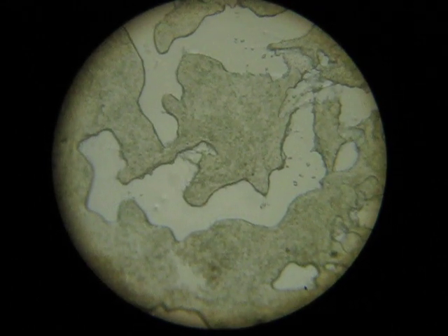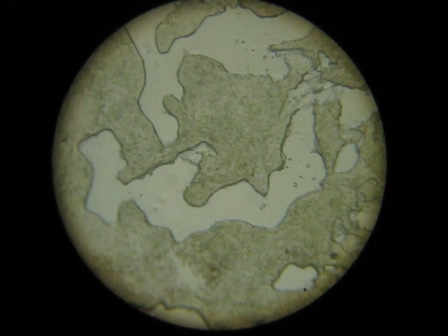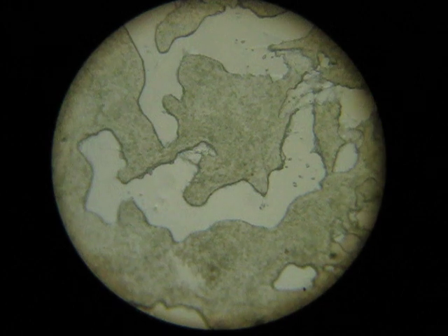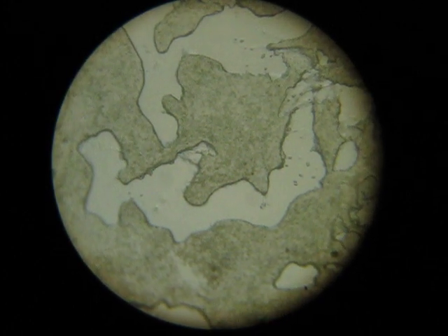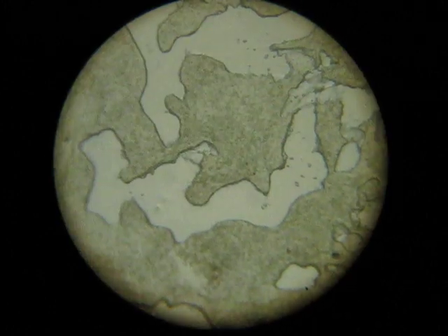Here we have got another image. Can you see those? Okay, so let's try a lens of more magnification.